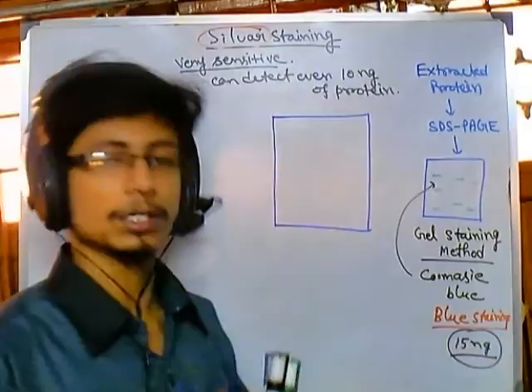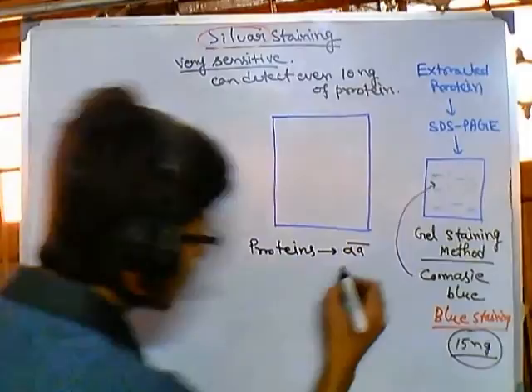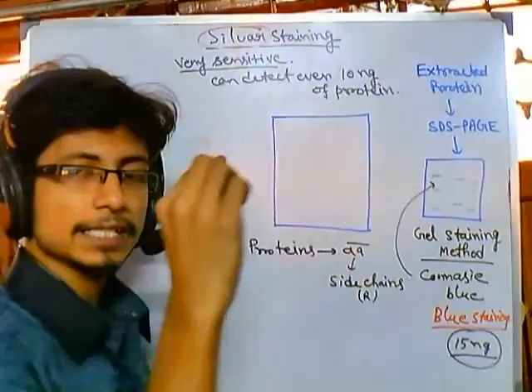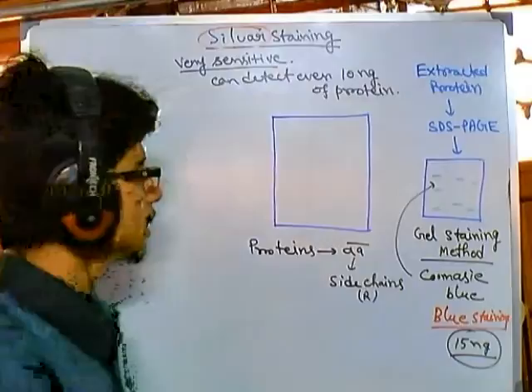The principle is that the proteins present here are made up of amino acid sequences. The amino acids have their side chains, we all know that, right? Side chains means the R group of the amino acid. Now this silver staining utilizes the stain as silver nitrate or silver acetate, whichever, we can take any of them, silver nitrate or silver acetate, right?